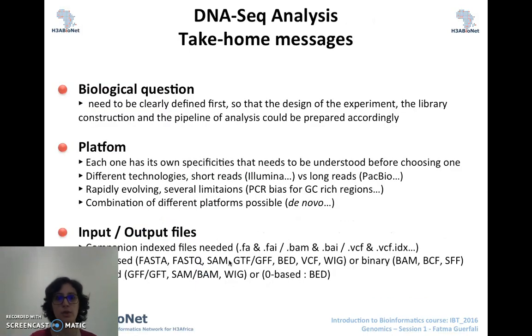So, as a conclusion, first, you need to be clearly focused on the question that you would like to address. The design of the experiment, the library construction, and the pipeline of analysis would heavily rely on this. Then you need to define the platform that you would use. Each one has its own specificities that need to be understood. You have different technologies, with different evolving rates, so make sure you keep updated about them. You have the possibility to combine different platforms if they give you different kinds of information.